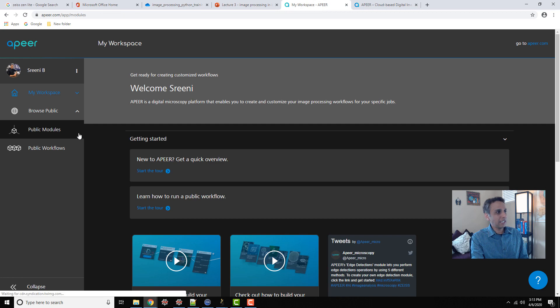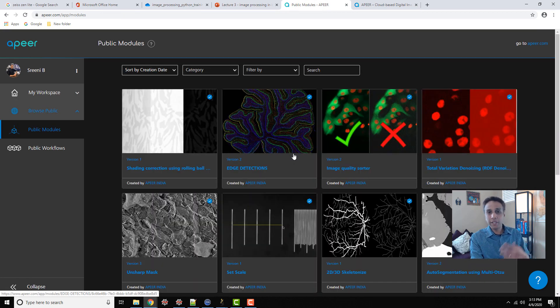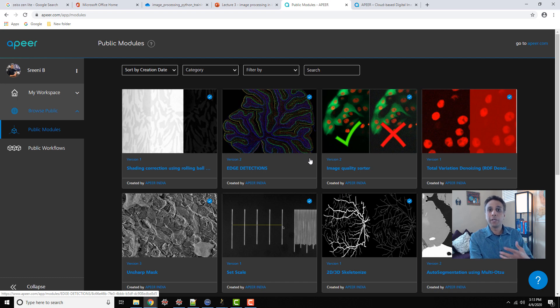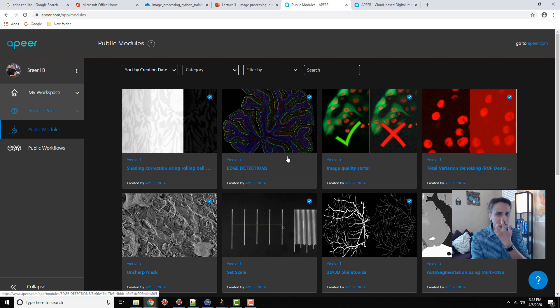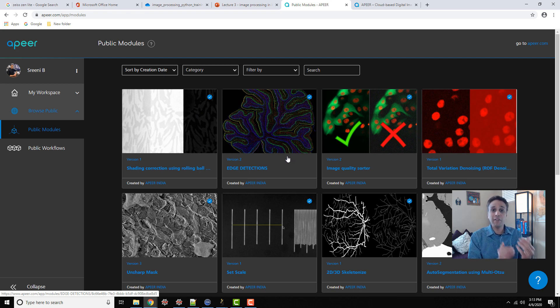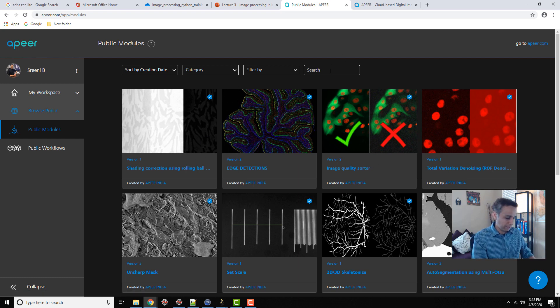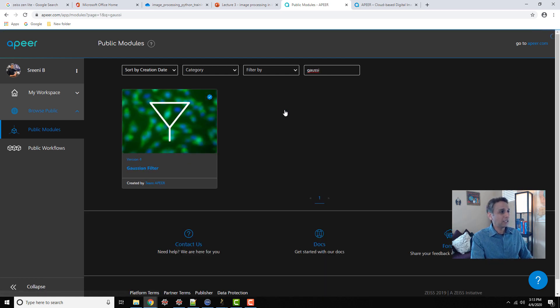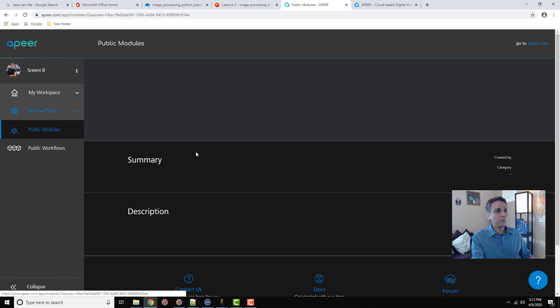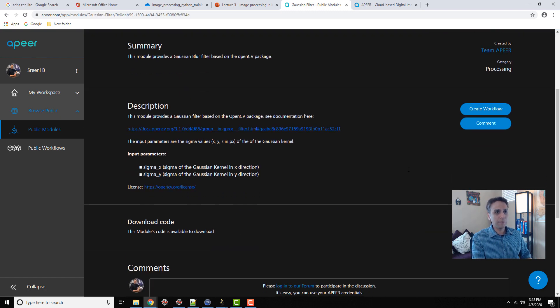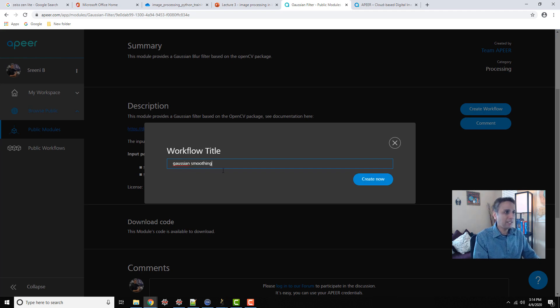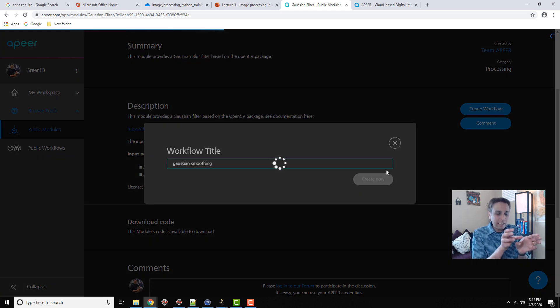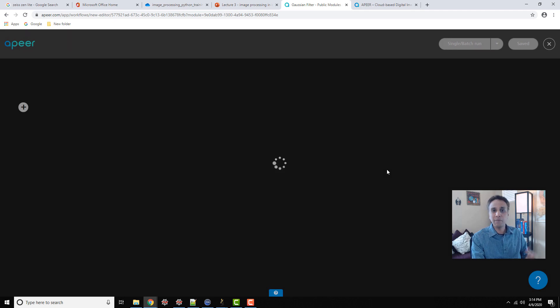So once you sign up, you can see a whole bunch of modules, mostly developed by Apeer team, but also contributed by third-party researchers like you. There are a lot of image processing tools. Think of these as plugins or macros that are pre-written but in a very usable way. We have shading correction, edge detectors, and a whole bunch of stuff. Let's do something simple. Let's do Gaussian filter. This is smoothing for noise. I can create a workflow, and I'll call this Gaussian smoothing.